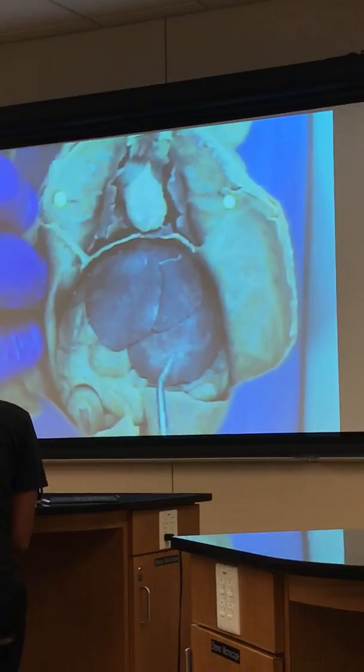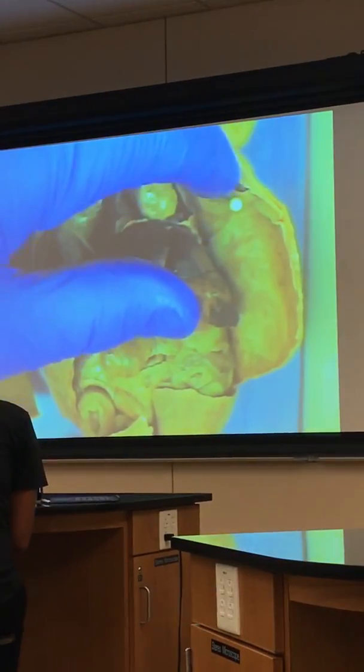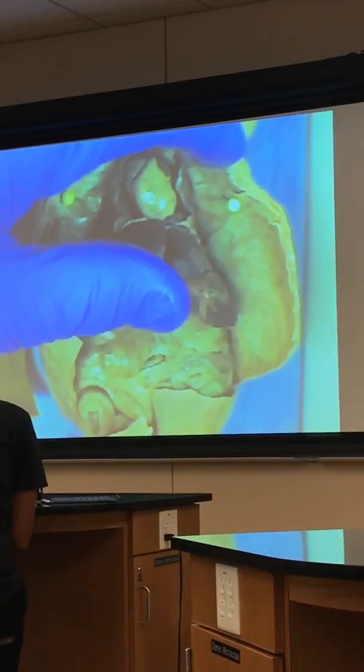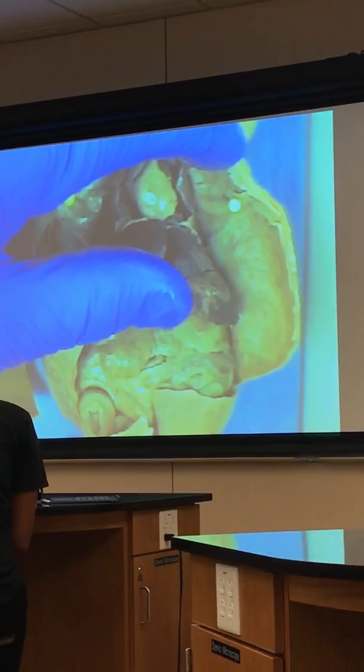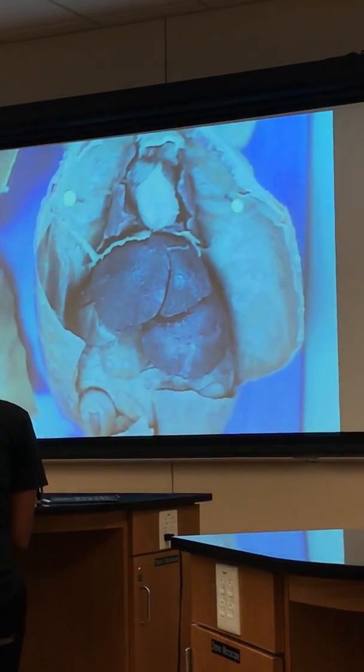is liver, all right? Don't worry about trying to find a gallbladder in the rat, because they don't have one, right? So every now and then I'll go, hey, extra credit if you can find the gallbladder. Oh, yeah. I'll give you 100 points. Make up for an exam, right?